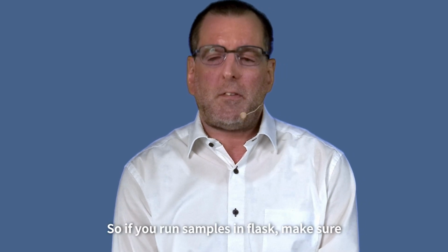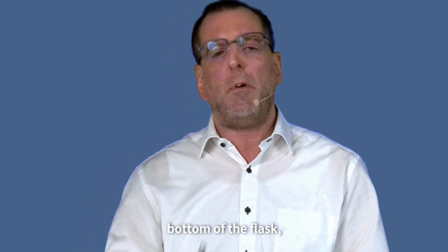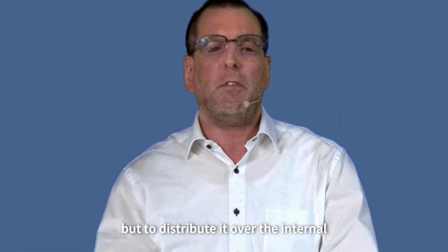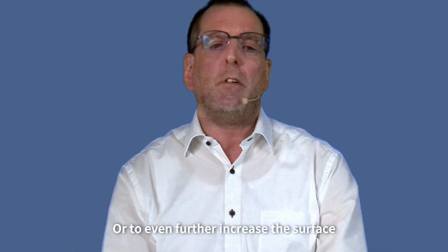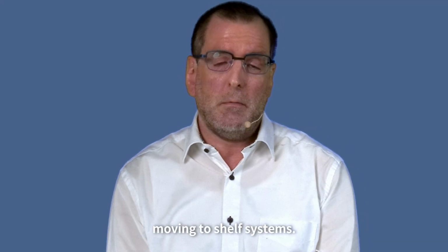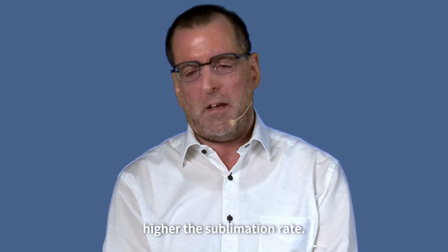So if you run samples in flasks, make sure not to have a very thick layer on the bottom of the flask, but to distribute it over the internal surface of the flask as much as possible, or to even further increase the surface area, you could consider moving to shelf systems. And there the guideline is very easy. The larger the surface, the higher the sublimation rate.